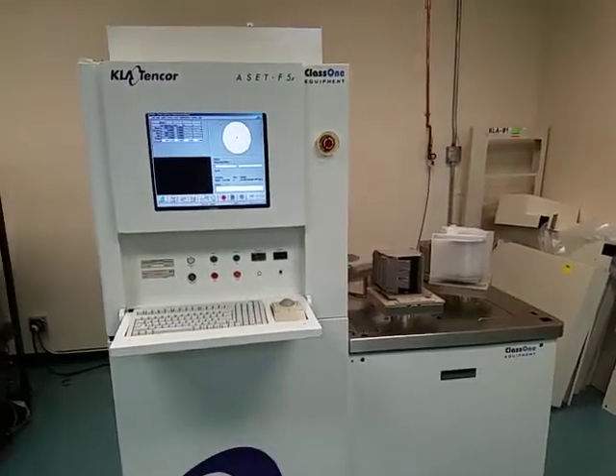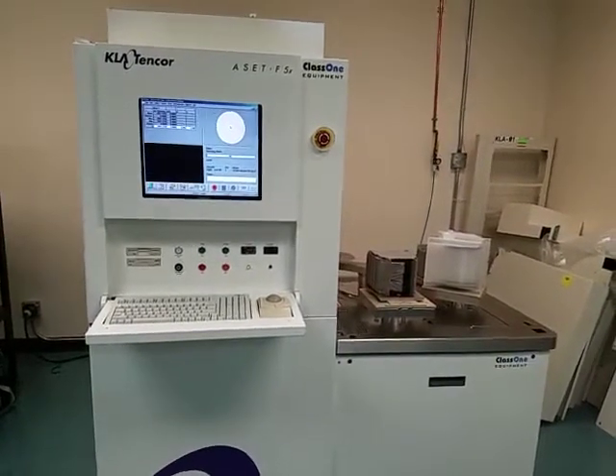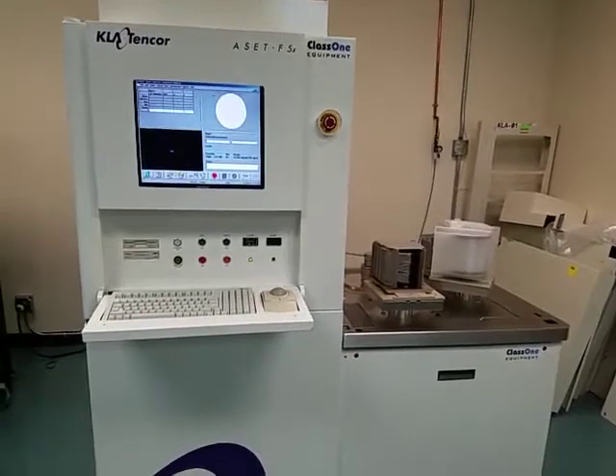Hello, we're here at Class 1 Equipment and this is the demonstration video for ID 4227, KLA 10-core Asset F5X thin films measurement system.